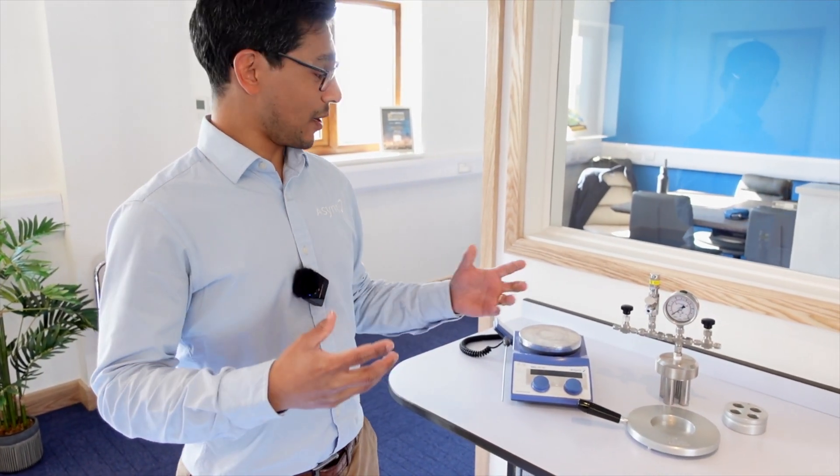Hi everyone, I'm Aaron from Ascint and today I want to talk to you about parallel high-pressure chemistry. That's really simple and really easy.